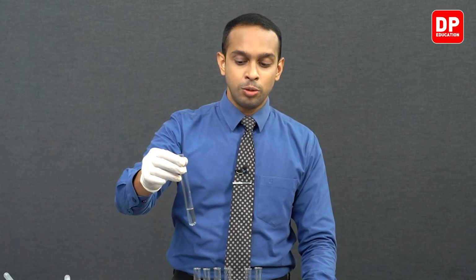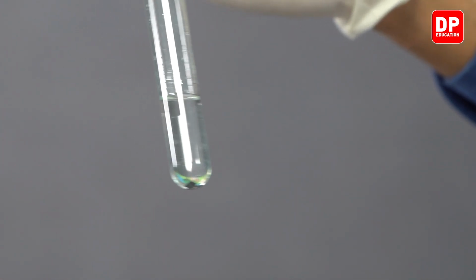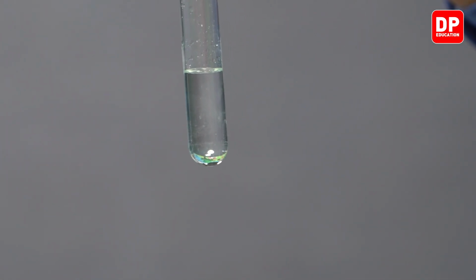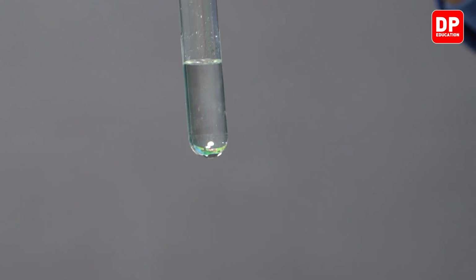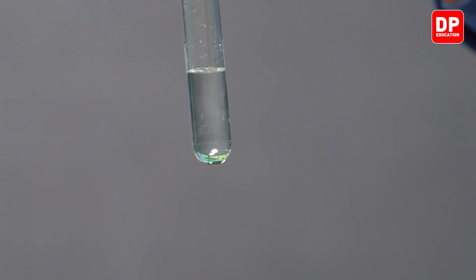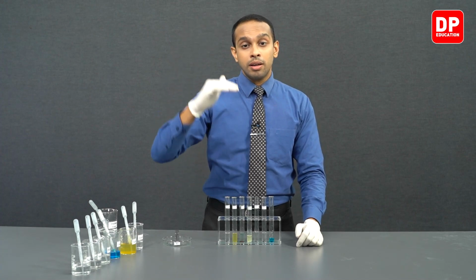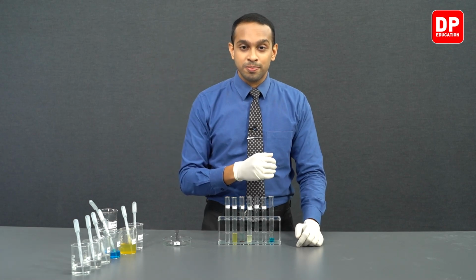Magnesium 2 plus aqueous ion solution, does it show a reaction with iron? The answer would be no. There is no precipitate formed. The added metal pieces are still at the bottom of the test tube unreacted. This indicates that iron did not react with magnesium 2 plus aqueous ions. Why won't it react with magnesium 2 plus? Because magnesium is more reactive than iron. So in the reactivity series, magnesium will be found at a higher location, or above iron.